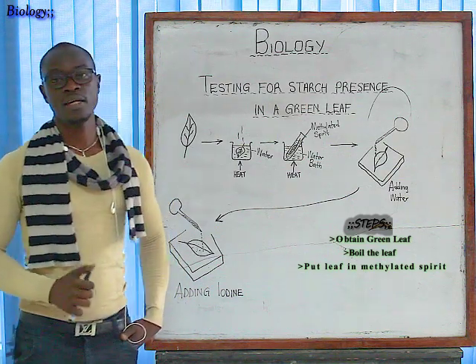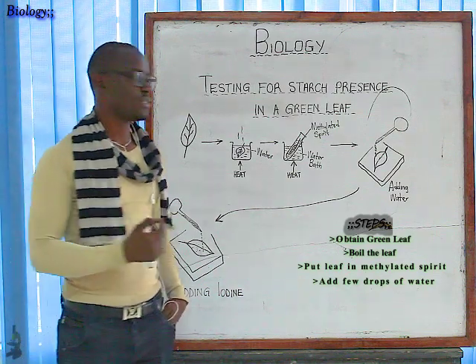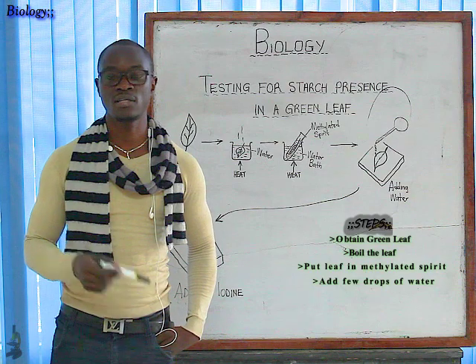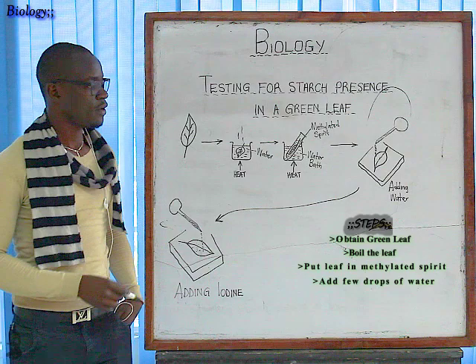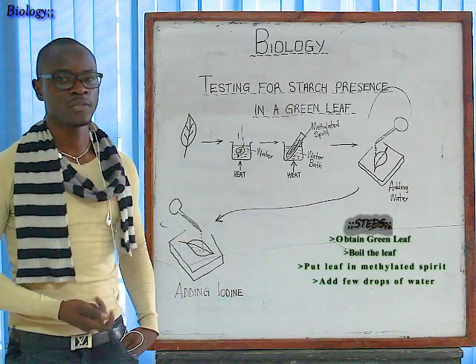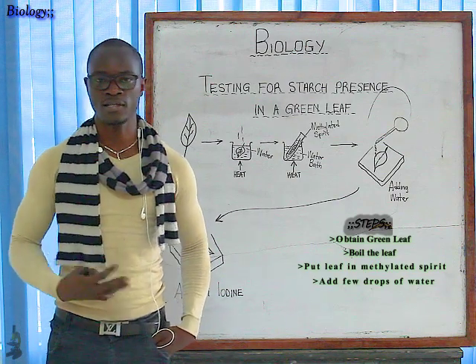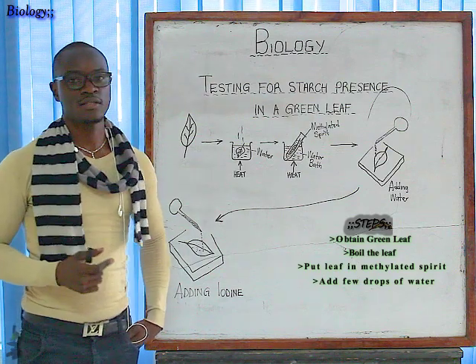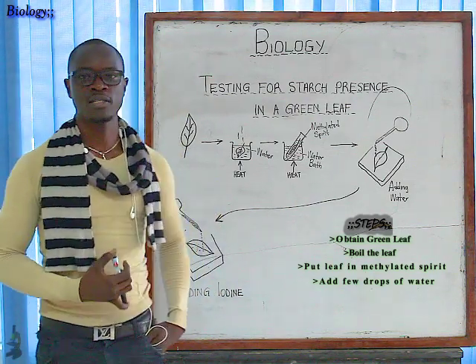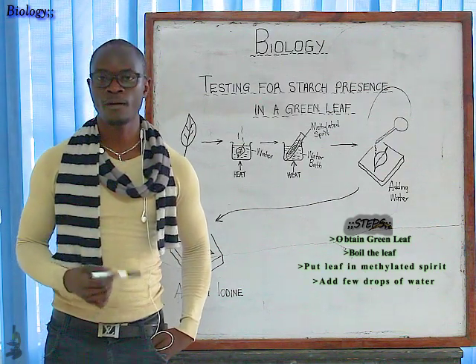After extracting the leaf from the boiling tube containing methylated spirit, take your leaf and place it on a white tile. Be very gentle with your leaf because it is very brittle — it can break at any time. In this step, add some drops of water to the leaf to rehydrate it, since the methylated spirit had dehydrated it. Take caution not to add too much water, as this might lead to a negative test for starch. Add only a few drops.